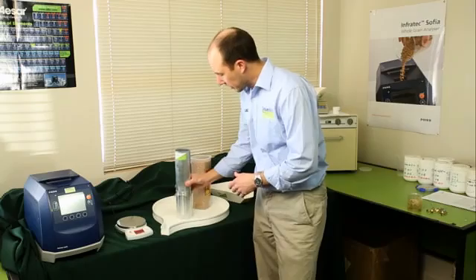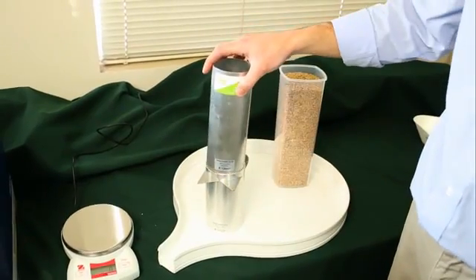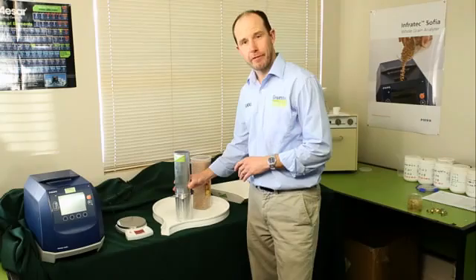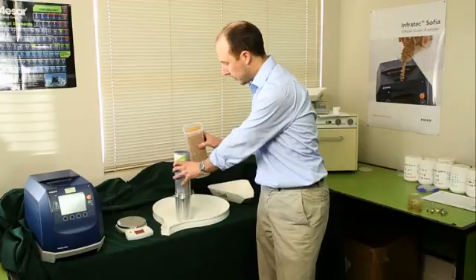So set up your chondrometer correctly. Make sure that the cutter bar is in, the filler is on top, and then fill the filler.